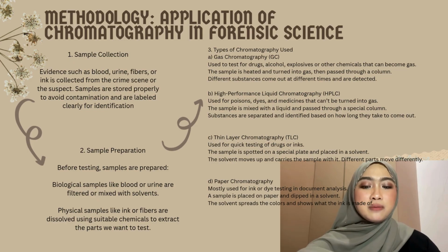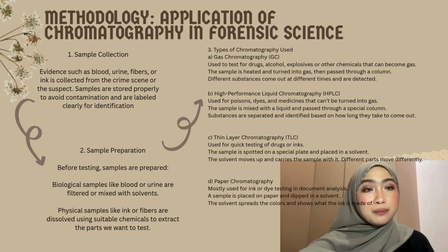Second, high performance liquid chromatography, HPLC. HPLC is used when the sample cannot be turned into gas, like some poisons or medicine.